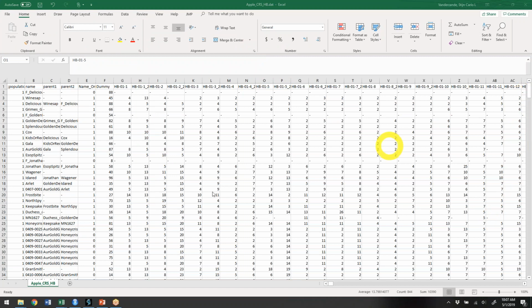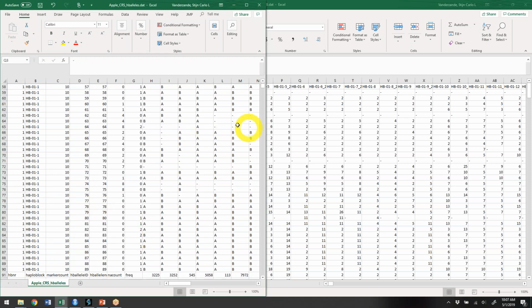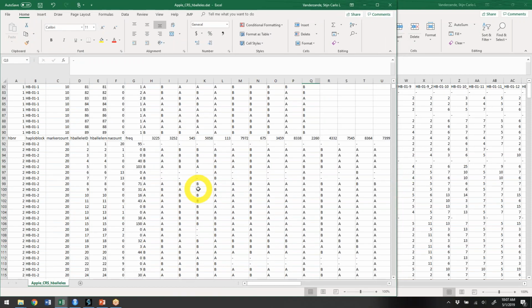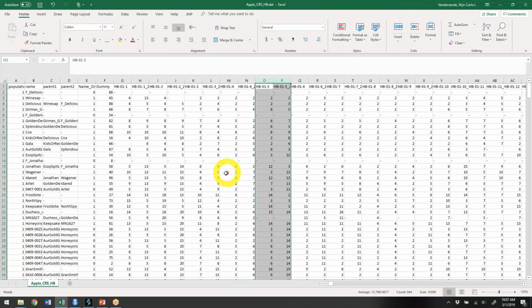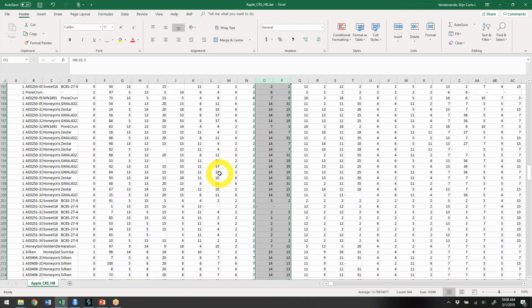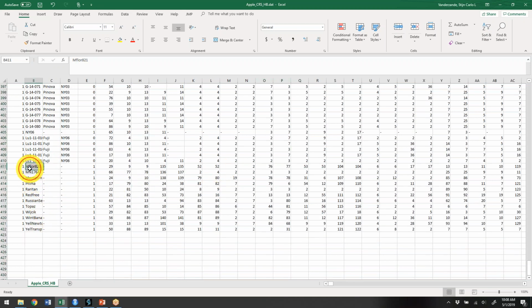As I've shown you in the haploblock definition file, most of the time a lot of these alleles just have a lot of missing data. Often, not always, they're the really high numbered alleles too. In this case it's not, but a lot of the time it is. When I looked at my data set for those 2 markers, I noticed that all the way at the bottom there are a bunch of individuals which are not directly connected to the pedigree, so phasing is much harder, or actually not really doable.